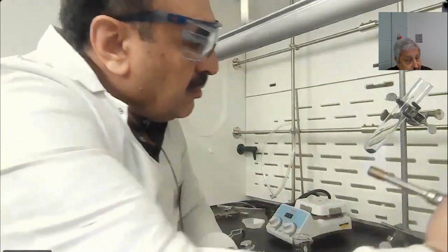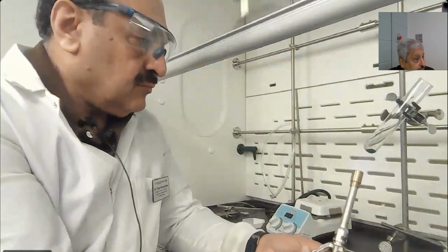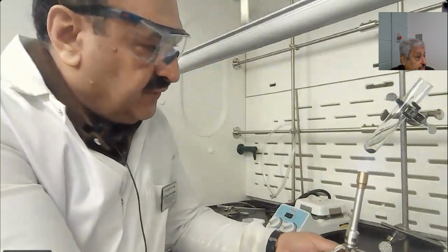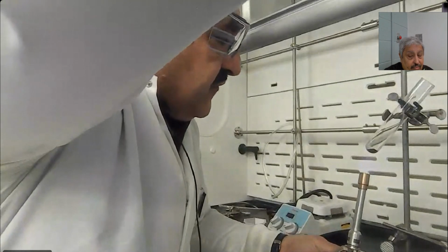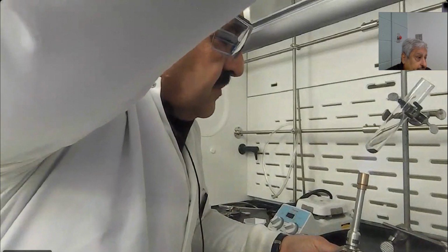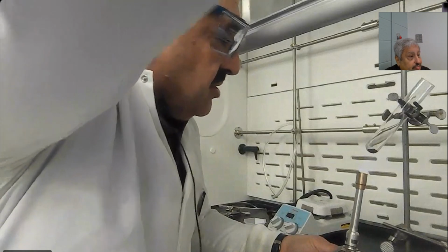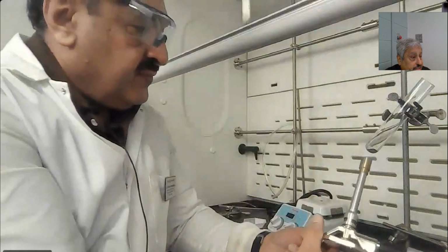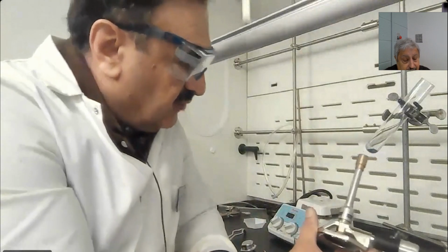Yeah, I'm not letting the students do this, playing with the Bunsen burner flame. He has a PhD, he knows what he's doing. But the flame is too high. Students are not allowed to do that. It's too risky. Use the flow of the gas. I mean, I did it in my research, but we know what we are doing, so we have more experience, too many years. Make sure you can control the height of the flame, but not the students.